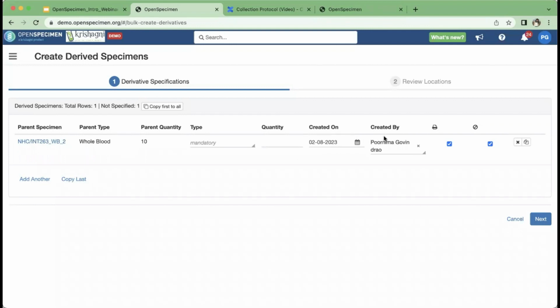What do you use for PDF reporting? Something like Word. So we don't have PDF reporting. The reporting allows you to export as a CSV. We do have some places, like in collection and order report, where you can download a report in a PDF format, which we call a manifest. But other than that, the reporting query results can be exported only as a CSV file.